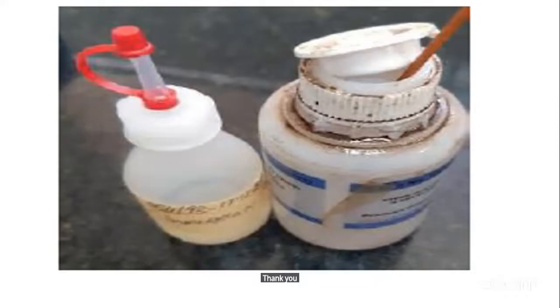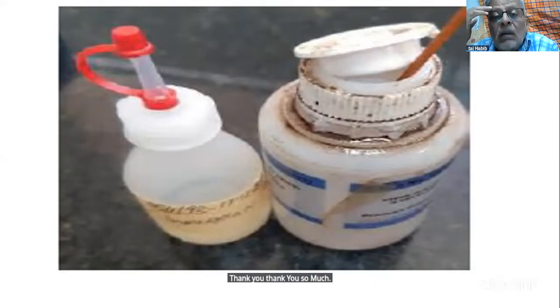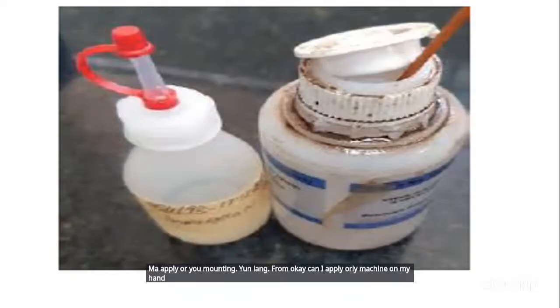Thank you. Hello. Can I apply oil immersion on my hands, skin as a preventing measure from drying and cracking from gloves powder? But then let me ask this one also. Penina Washira is asking, can you use methylated spirit instead of alcohol swab to clean your lens?